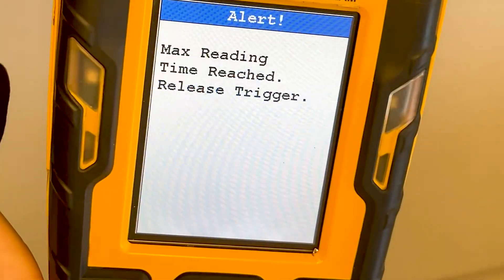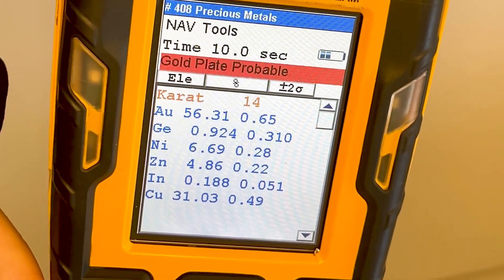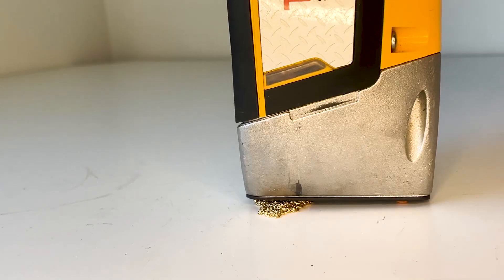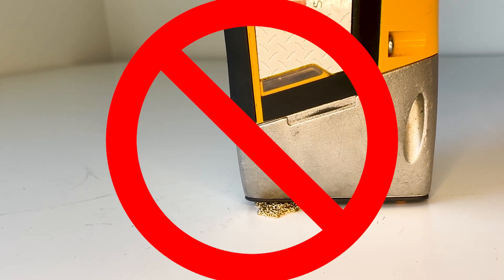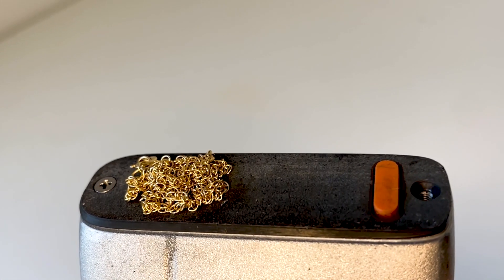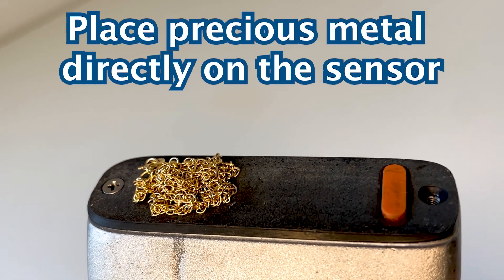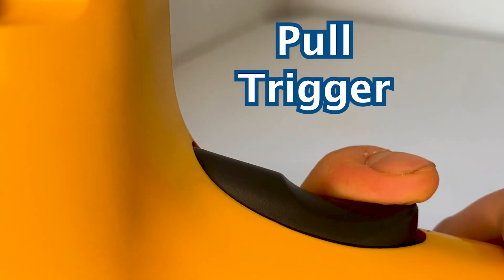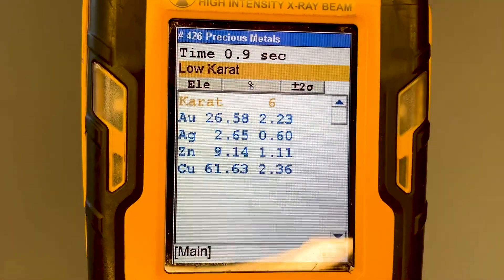It will display the caretage as well as any element it detects. Next, let's test this gold chain. The precious metal doesn't cover the whole sensor, so testing on any surface will yield inaccurate results. Instead, place the precious metal directly onto the sensor and point it straight in the air. Once again, pull the trigger and hold it for 10 seconds while the results generate.